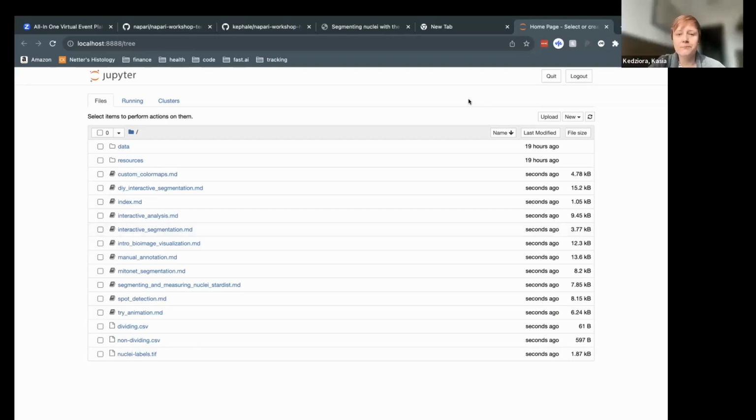So what happened to, I will try to make this a smoother experience for you. As some of you observed, when you start the workshop in this way, the original napari window that I was using closes and I get access to Jupyter notebooks that open in a tab in my browser. If some of you would prefer to get this repository and start playing with the notebooks in a different way, that's perfectly fine. But this is the easiest way to follow. So I will stick to this way today.